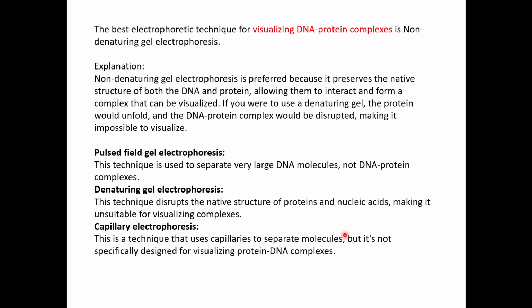your autoradiography. Next is visualizing your DNA protein complexes. The best electrophoretic technique for visualizing DNA protein complexes is non-denaturing gel electrophoresis. Non-denaturing gel electrophoresis is preferred because it preserves the native structure.